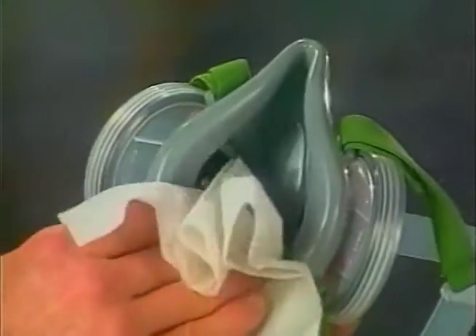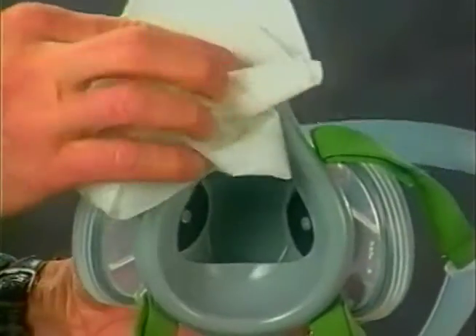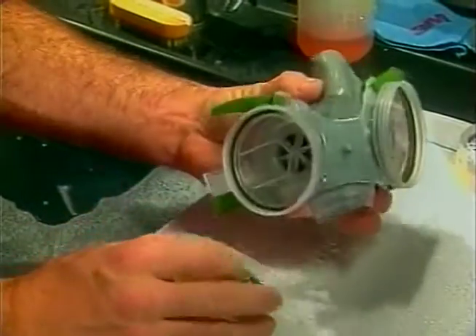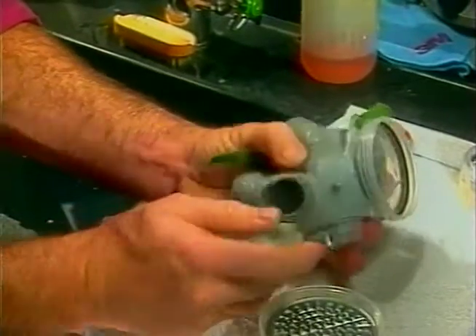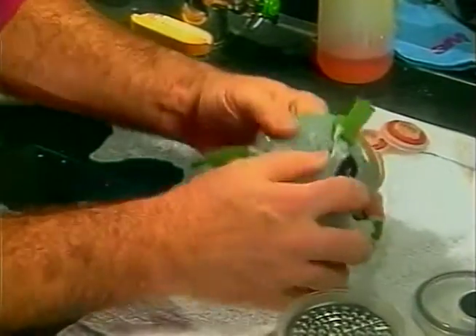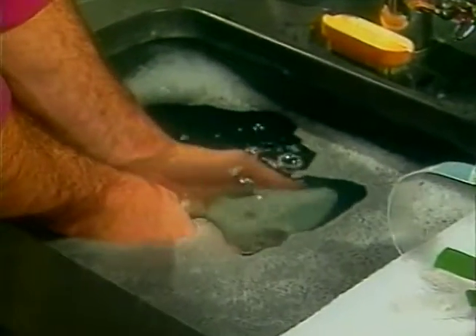This type of respirator must be cleaned on a regular basis. Commercial respirator wipes can be used. However, they must not be the only method in place. After first removing the cartridges and filters, the preferred method is to wash the respirator in warm water containing a mild soap. The water temperature should not exceed 50 degrees Celsius.